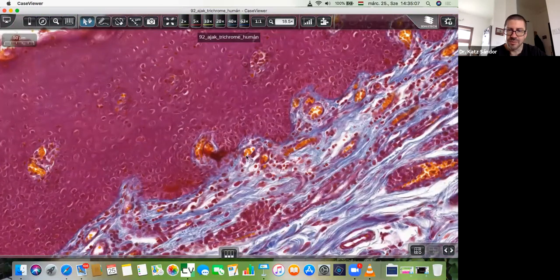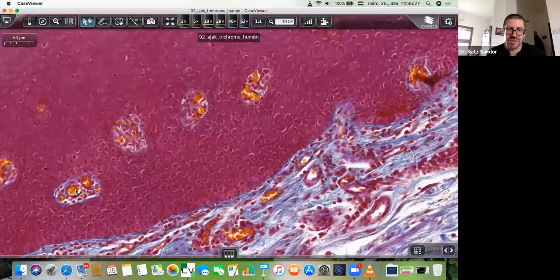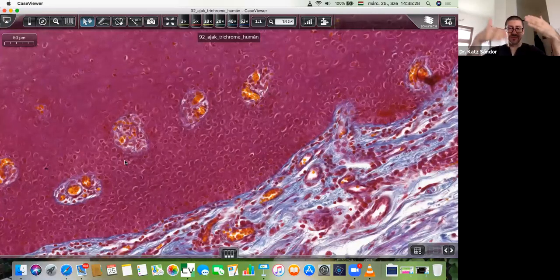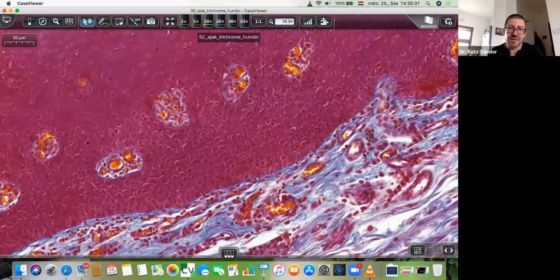The lower part, the dermal layer underneath the epithelium, represents papillae, and these papillae invaginate into the upper layer. These circular structures with vessels are because of the section, the wavy line section of the dermal papillae. They are the invaginated parts of the lower layers. It's because of the section they relate to the connective tissue underneath.